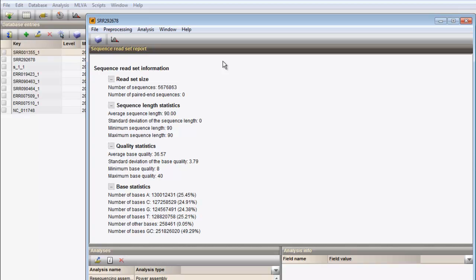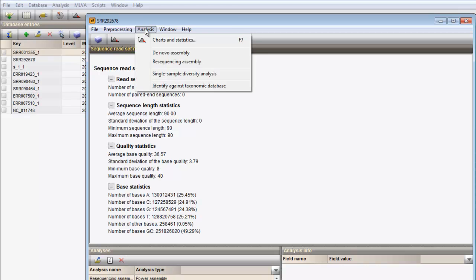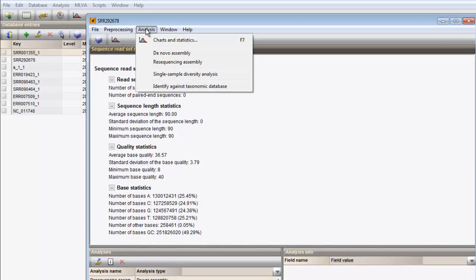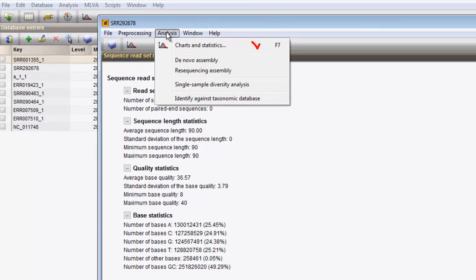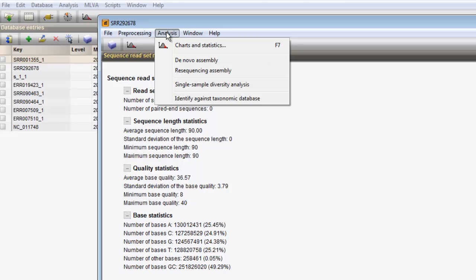From the Sequence Read Set experiment card, different analyses can be launched on the preprocessed data. Three analysis types are available: first, the charts and statistics functionality; second, two different assembly analyses; and third, two metagenomics approaches.